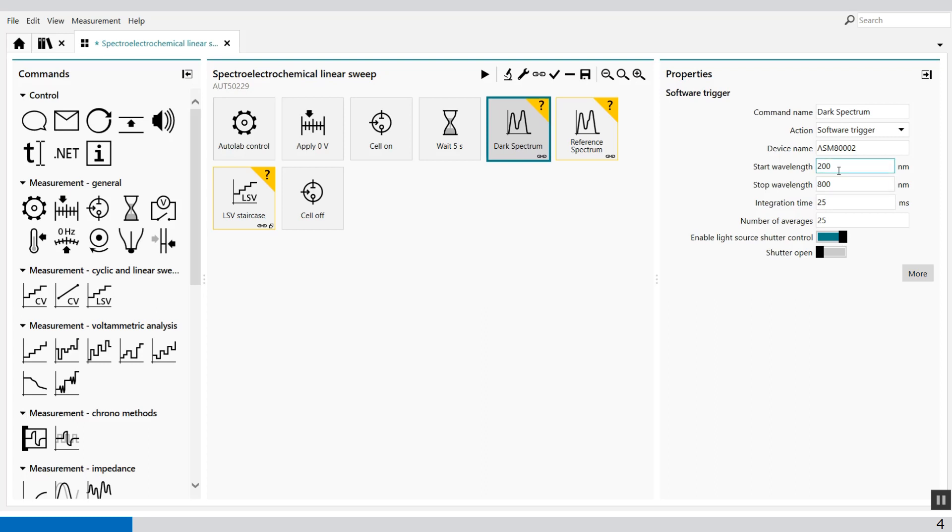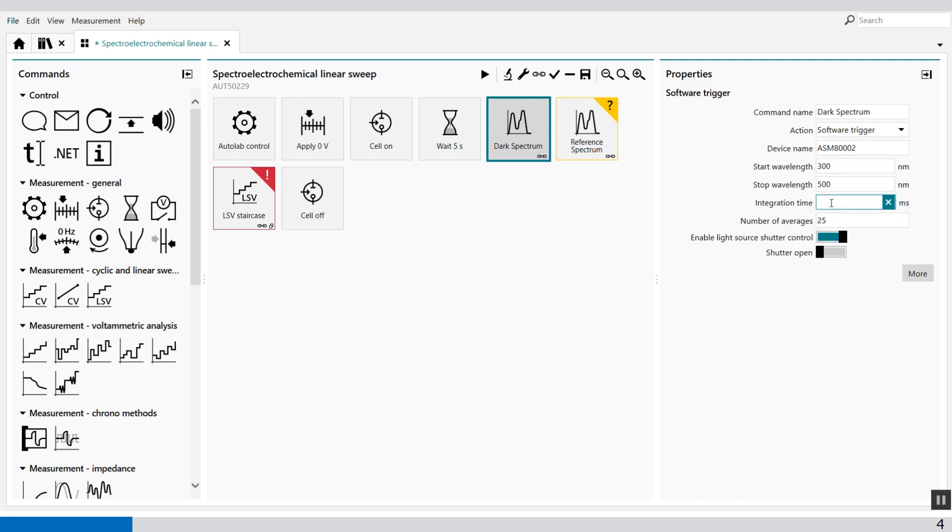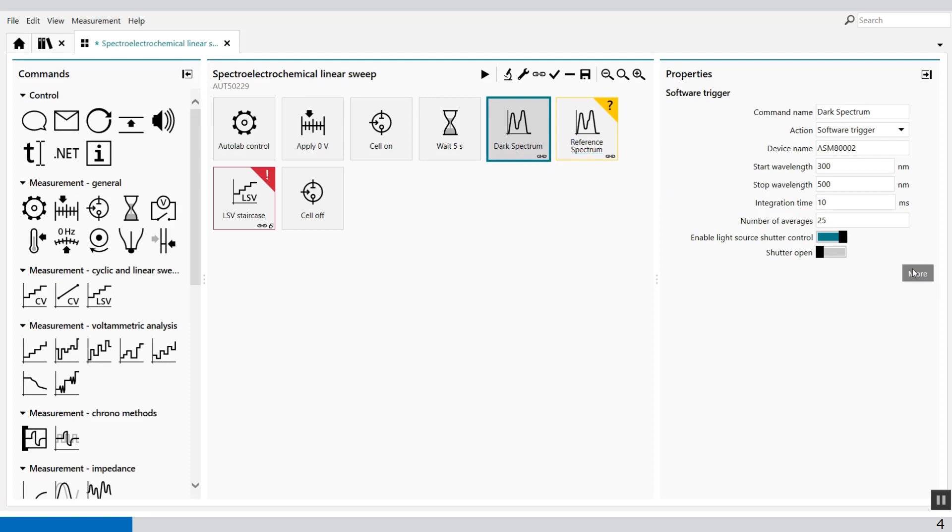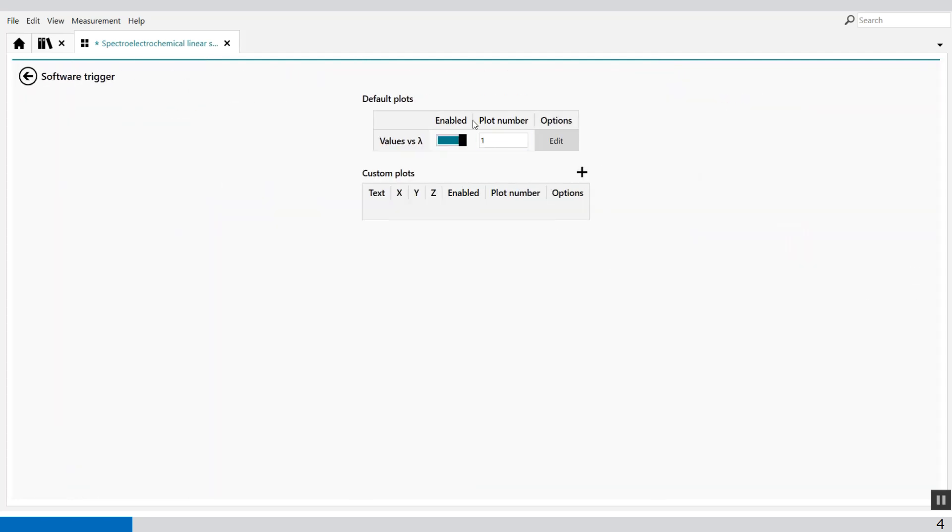So I'm only interested from 300 nanometers to 500 nanometers. Like this. Then the integration time I set to 10 milliseconds and I take a number of averaging of 25. This is my dark spectrum and the plot is visible in plot number one.